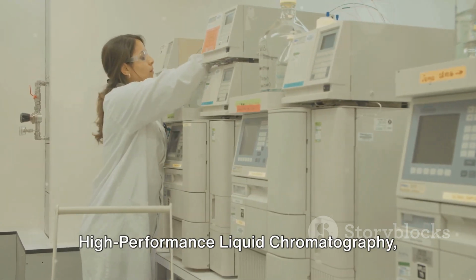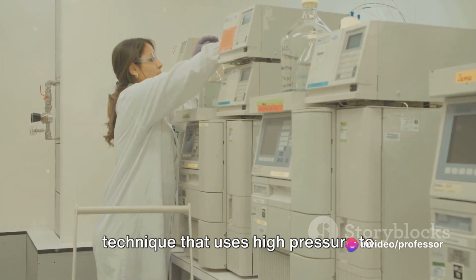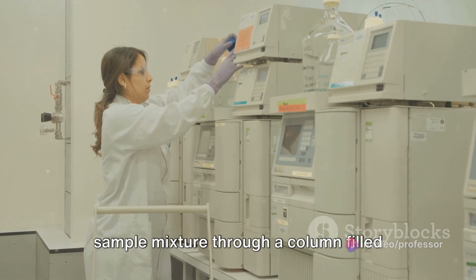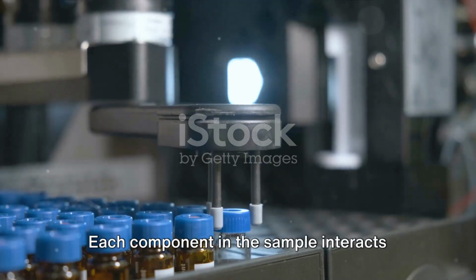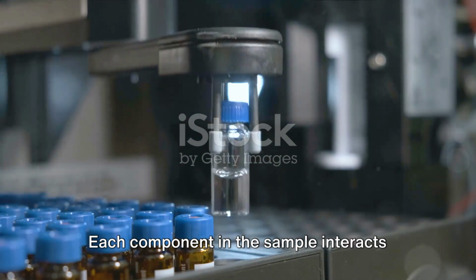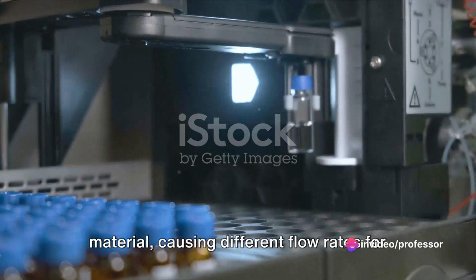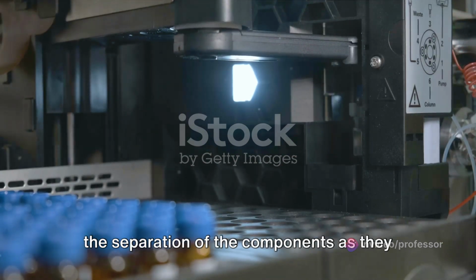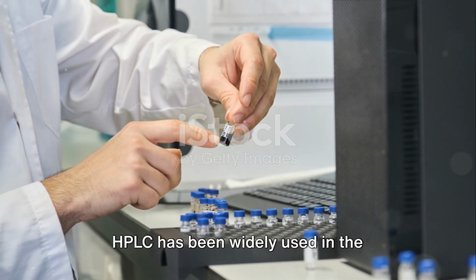High-performance liquid chromatography, or HPLC, is a highly sophisticated technique that uses high pressure to propel a liquid solvent containing the sample mixture through a column filled with a solid adsorbent material. Each component in the sample interacts slightly differently with the adsorbent material, causing different flow rates for the different components and leading to the separation of the components as they flow out of the column.